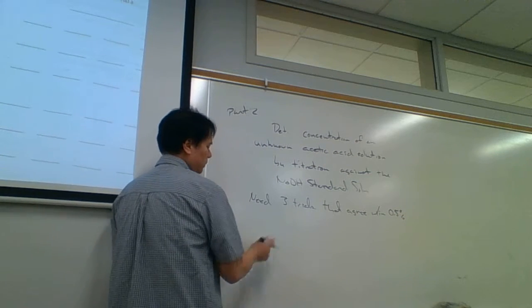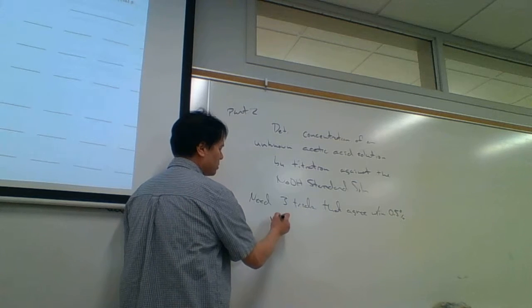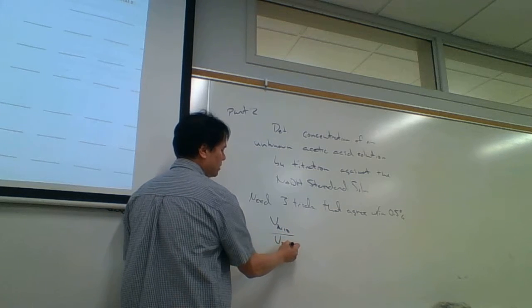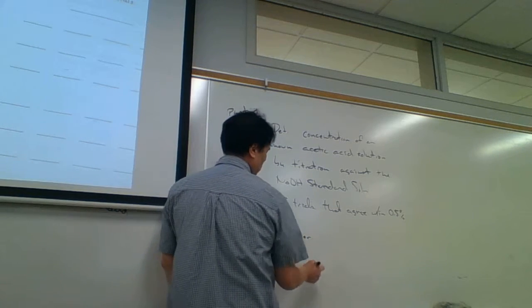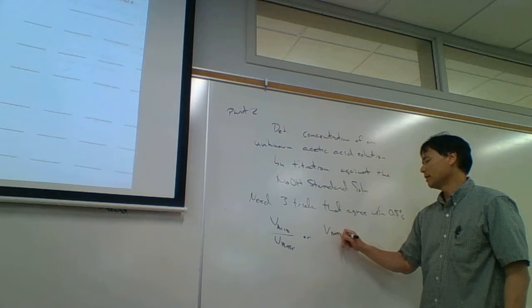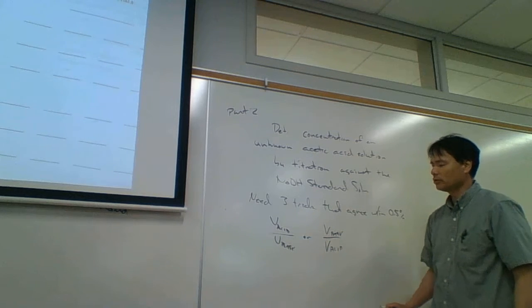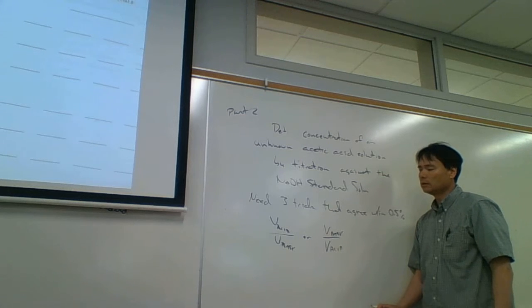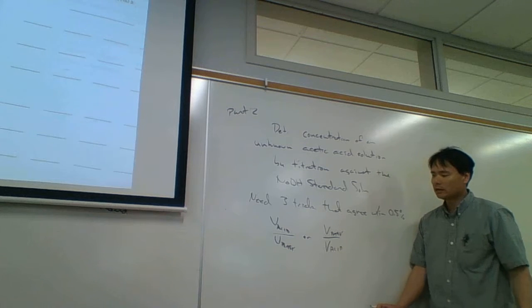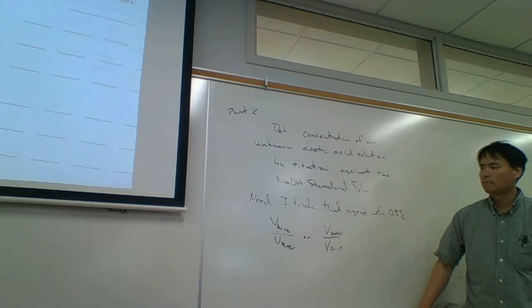And so what we'll do, we're just going to do a simple calculation just to check agreement. We aren't going to do the final calculation. And so that is, we're just going to take the volume of the acid divided by the volume of the base, or it doesn't matter, the volume of the base divided by the volume of the acid. You know, we just want a ratio. And this ratio should be the same for all 3 trials. But it isn't. You know, there's going to be some slight experimental variation. But we want to make sure that experimental variation is kept to within 0.5%.